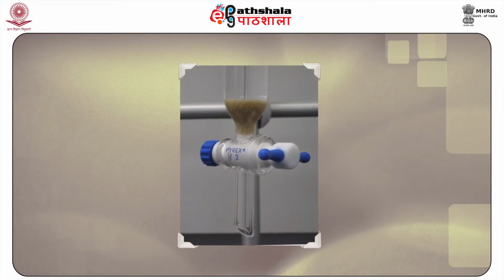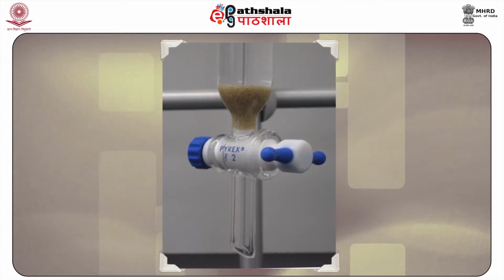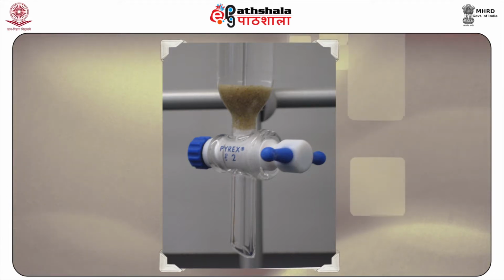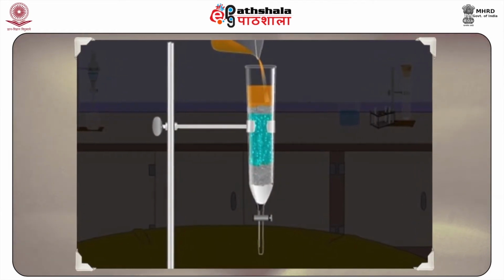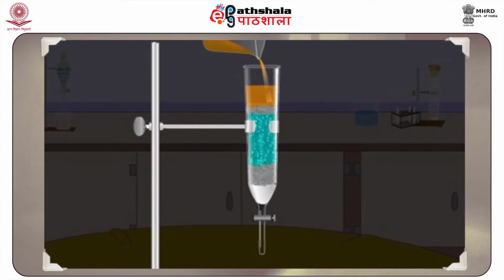For the wet method, a slurry is made by mixing up the powder of a stationary phase and the eluent outside the column. The slurry is then carefully packed in the column. Proper care should be taken so that bubbles are not formed during this packing. All the sample components show differential affinity towards the stationary phase and thus elute out of the column at different times along with the moving mobile phase.